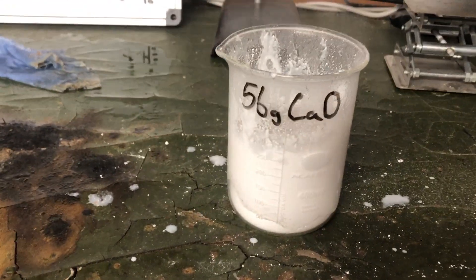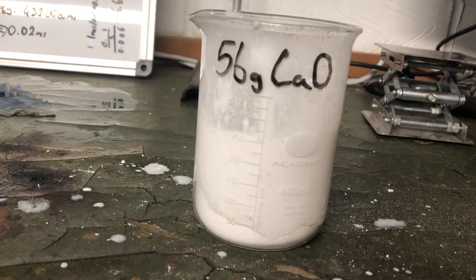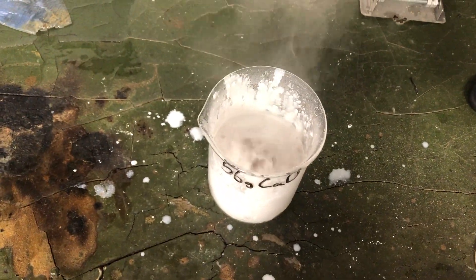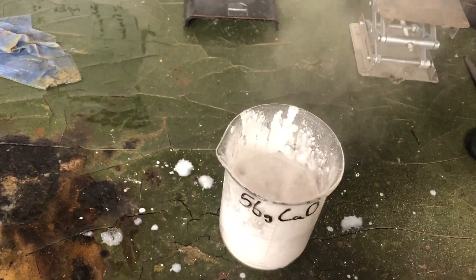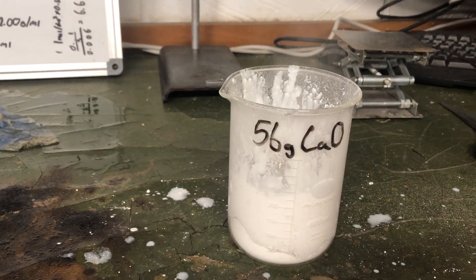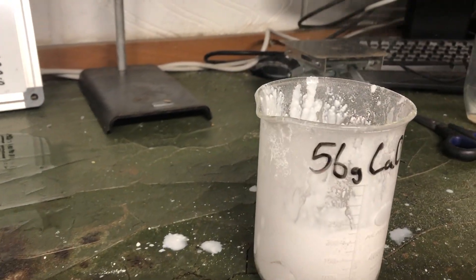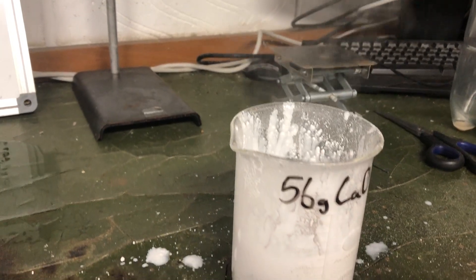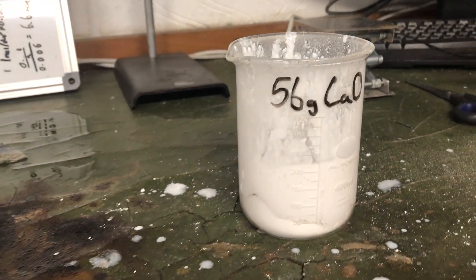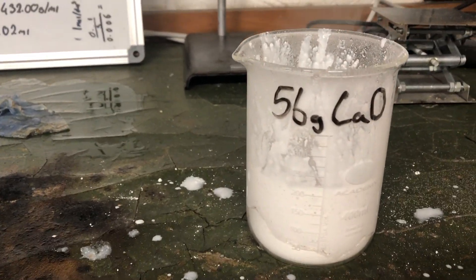Let's see what we're going to do. I think I'm going to need to add some water into this. So after a while I'll give it a thorough rinsing and it should be calcium phosphate.